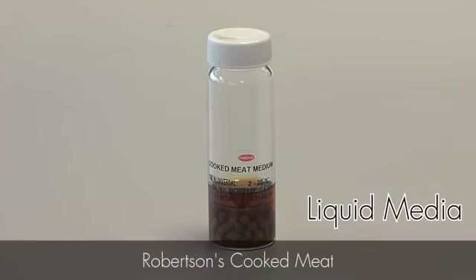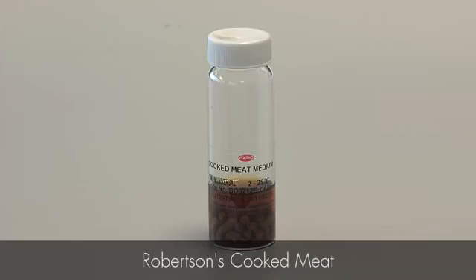Robertson's cooked meat is an example of a liquid culture system which is used in the laboratory. It is exactly as it says, it's sterilised cooked meat and is used to allow the growth of fastidious microorganisms. The idea here is that a patient sample is inoculated into the cooked meat and this is incubated to allow any bacteria to grow. After 24 hours growth, a portion of this is transferred, the word is subcultured, onto solid media such as blood agar.